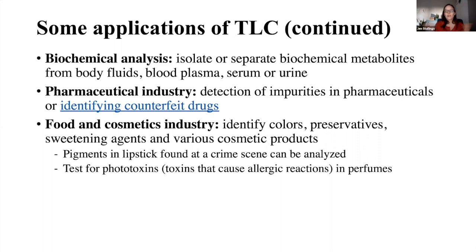It was like Tylenol or aspirin or something, and it wasn't actually the malaria drug. So that's another way to use TLC to identify counterfeit drugs. The food and cosmetic industry. So you can look at if there's preservatives, you can spot a preservative on a plate and run that plate and see if there's preservatives in your product.